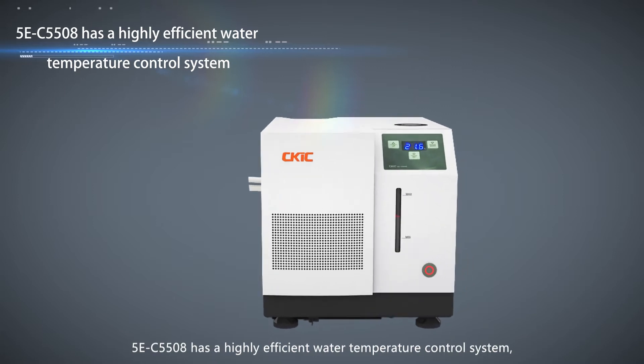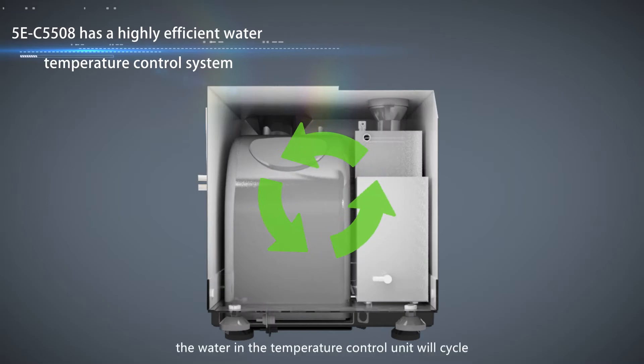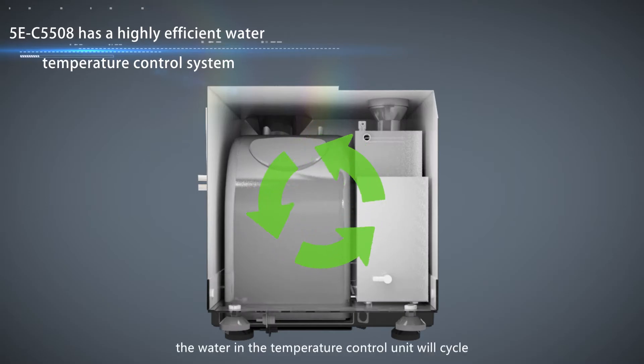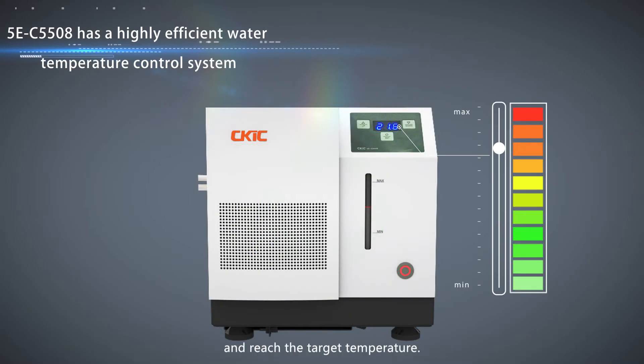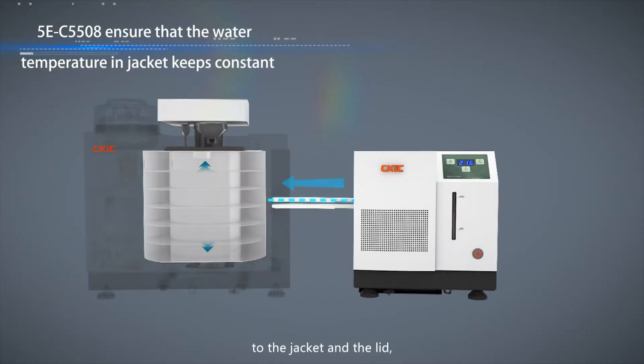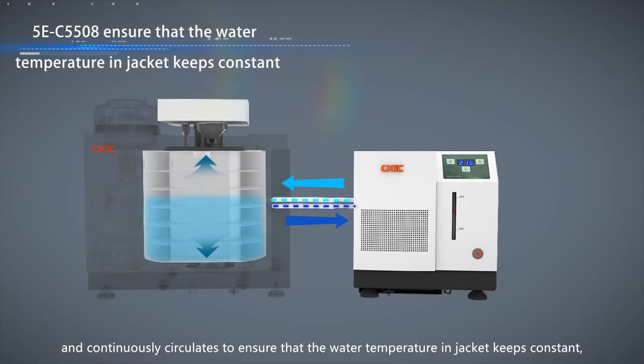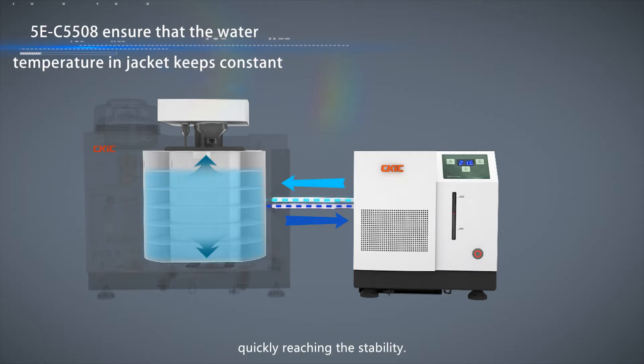5EC5508 has a highly efficient water temperature control system. Before the analysis, the water in the temperature control unit will cycle and reach the target temperature. The water in the temperature control unit flows to the jacket and the lid and continuously circulates to ensure that the water temperature and jacket keeps constant, quickly reaching stability.